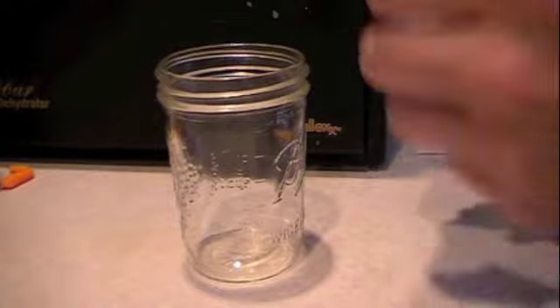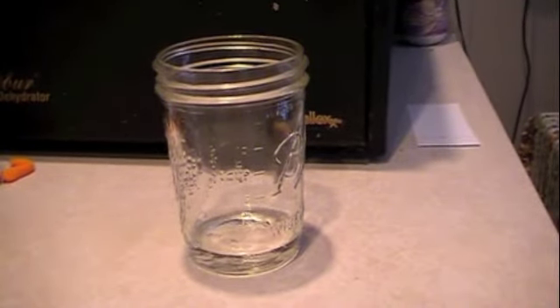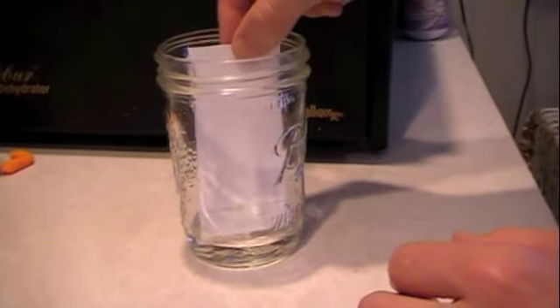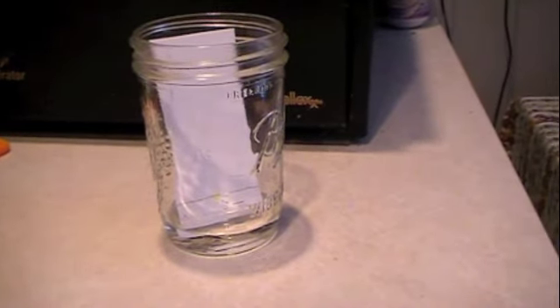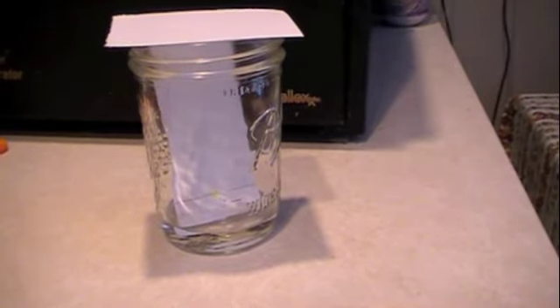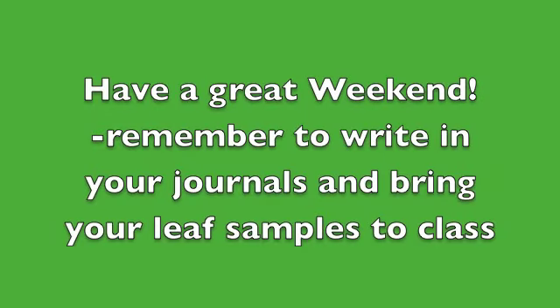Repeat the chromatography procedures that we did this past week, putting a little solvent in the bottom of your beaker, and then putting your chromatography paper in the chamber. Now that we've gone over the procedure for Monday's lab, we're ready to do the investigation. Please remember to write in your journals and bring your leaves to class on Monday.